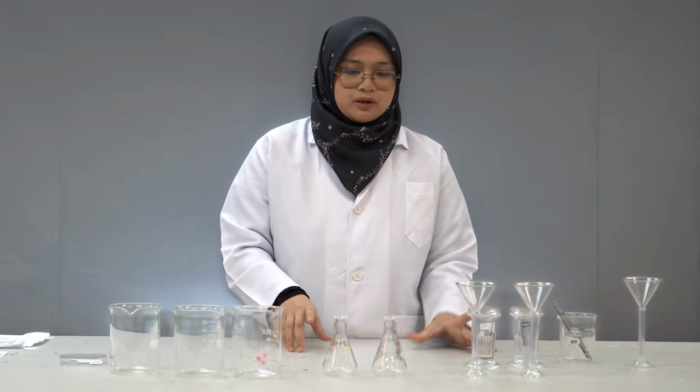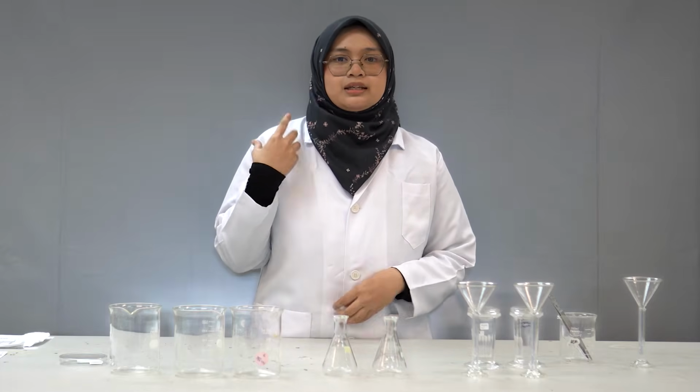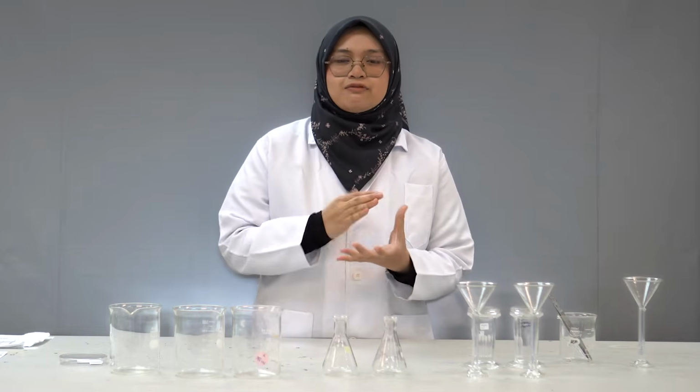We must make sure that we close the containers that contain acid and base, because acid and base evaporate very fast, so we want to prevent that from happening.